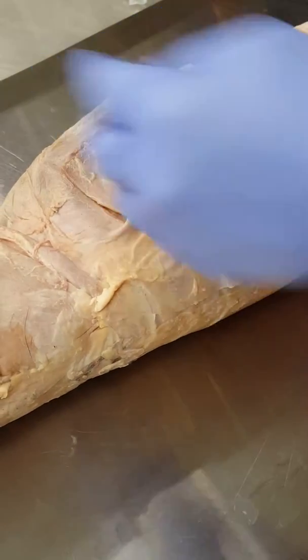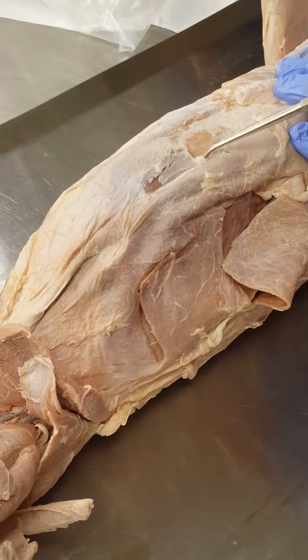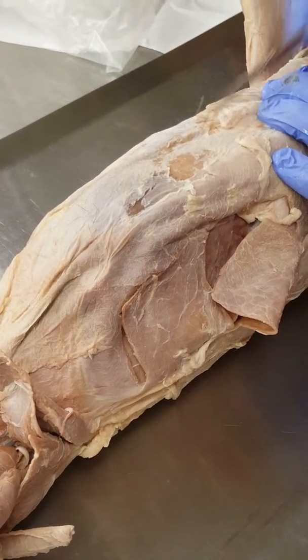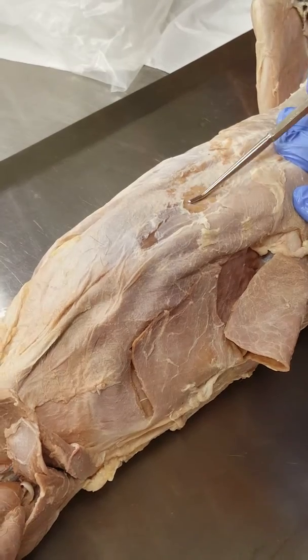Then you also have your rectus abdominis. Right, so when you look for your rectus abdominis, you have to get through the sheath. So there was this rectus sheath that was covering, like right here. And once you get past that, the fibers of the rectus are going straight up and down, like that. Right? So that's rectus abdominis, right in the middle.